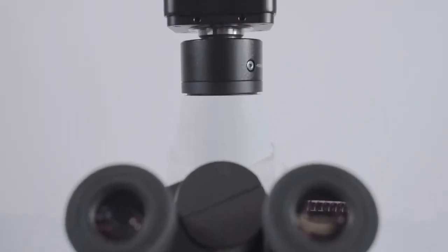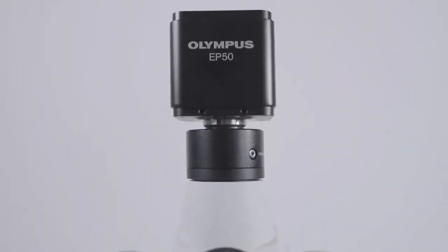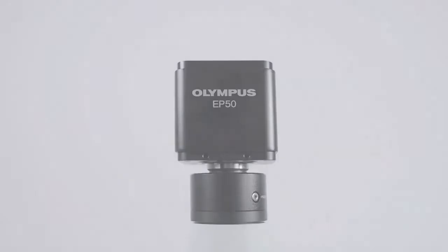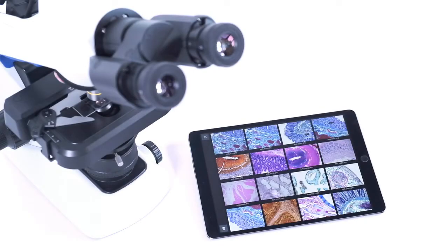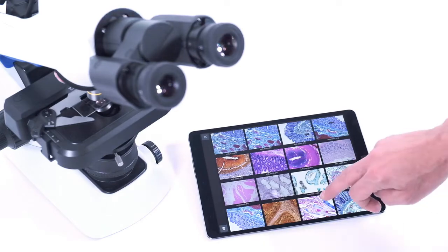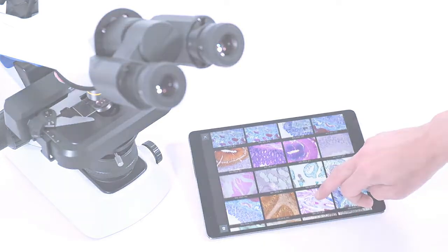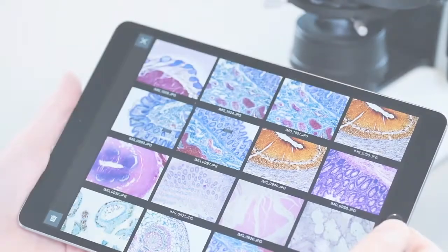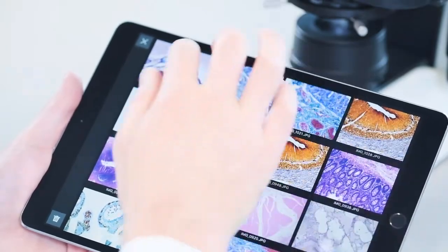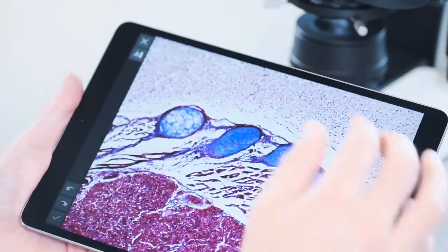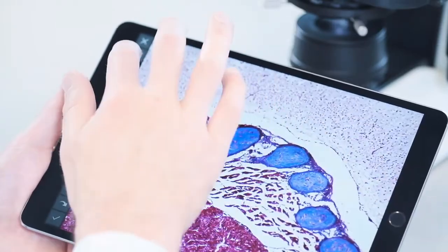Equipped with the WLAN-capable Olympus EP50 camera, every microscope in a classroom becomes a wireless imaging system, enabling lecturers to teach and students to learn in an engaging digital environment.